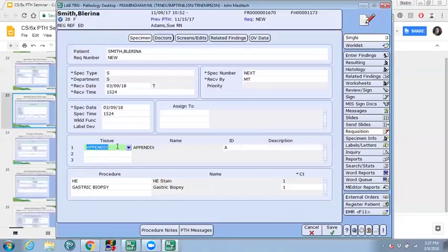If you do remember on page 3 of the tissue in medical term type, we did have the procedure to be defaulted immediately, such as the gastric biopsy. That is why we have only one defaulted at this point. But for the specimen type, if you notice on page 3 of the specimen type dictionary, I had a default procedure. That is where the HE stain is coming from.